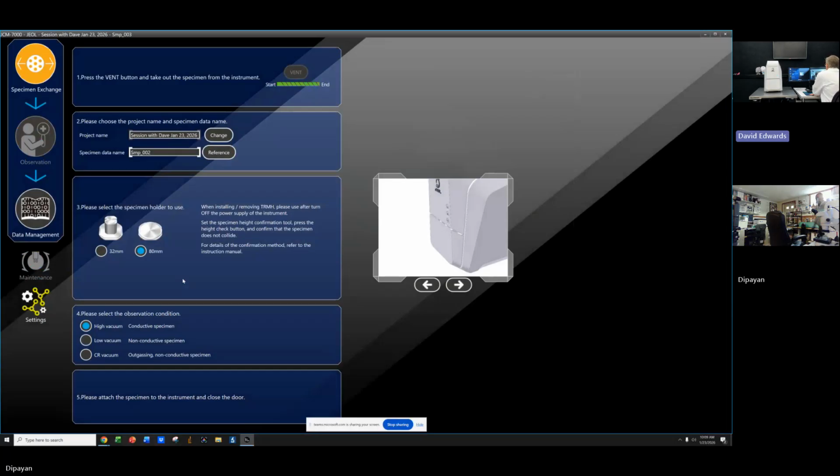But one of my thoughts is, for whatever reason, the USB camera plug is in the wrong port or something like that. Can you show me what the USB camera port is supposed to be? Honestly, I don't know. I've got a bunch of USB cables out the back of my PC, and I don't know which one's the camera and which one's something else. Yeah, they're all kind of bundled in the back.